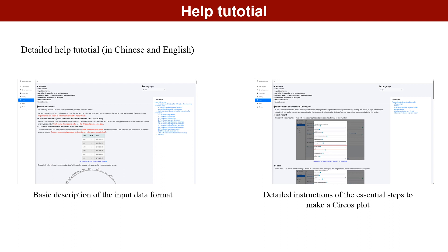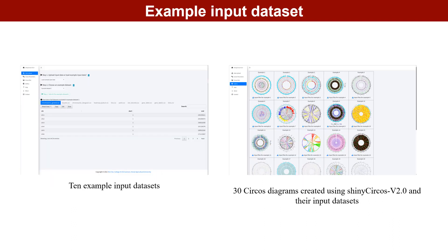A detailed help manual in Chinese and English on the help page of ShinyCircos v2.0 explains the input data format and drawing parameters of different drawing types. On the Data Upload page, users can choose to use the example dataset to create a Circos graph. On the Gallery page, we provide 30 Circos diagrams created using ShinyCircos v2.0 along with their input datasets.